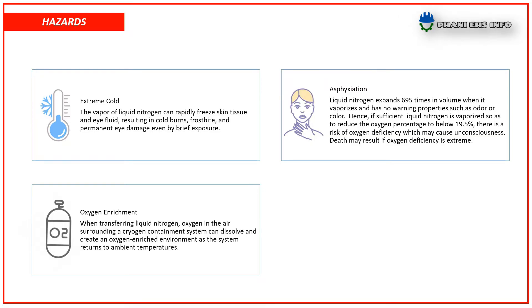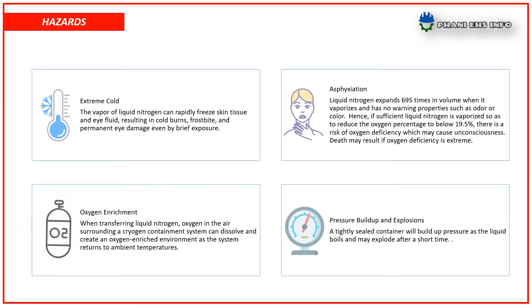Oxygen enrichment — when transferring liquid nitrogen, the oxygen in the air surrounding a cryogenic containment system can dissolve and create an oxygen-enriched environment as the system returns to ambient temperatures. Pressure buildup and explosions — a tightly sealed container will build up pressure as the liquid boils and may explode after a short time.